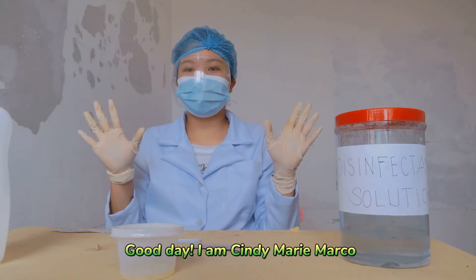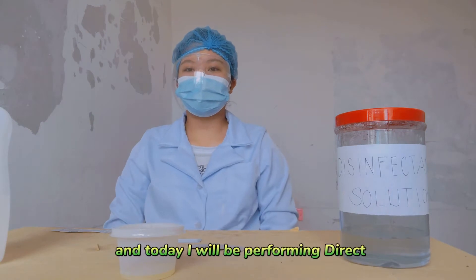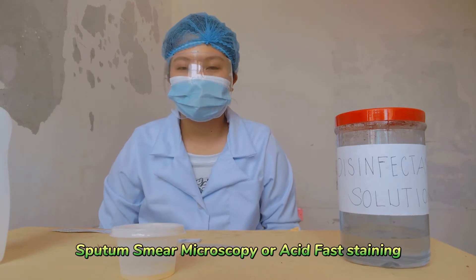Good day! I am Cindy Marie Marco, a medical laboratory science student, and today I will be performing direct sputum smear microscopy or acid-fast staining.